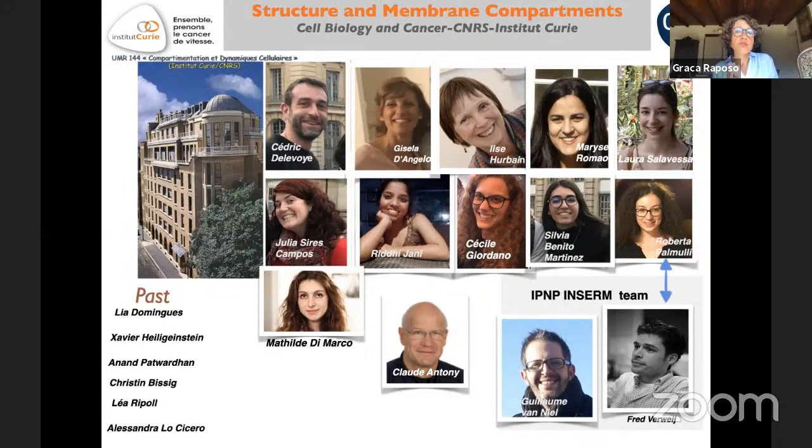We are going to use conventional electron microscopy: just fix the cells, embed the cells in resins, like I showed you in the beginning, using a protocol that is adapted to these cells that are in suspension in this case. And then we're going to look at what the cells have in their belly, the morphology of these cytolytic granules in these patients in relation to the control.